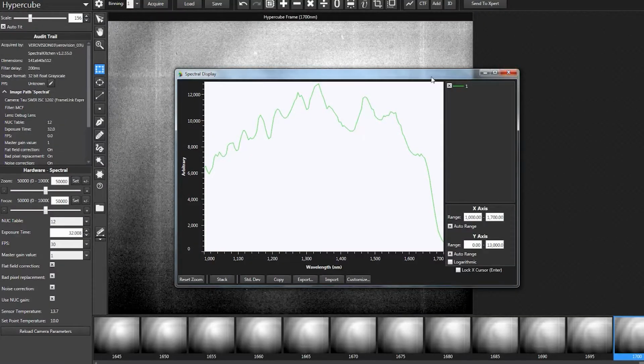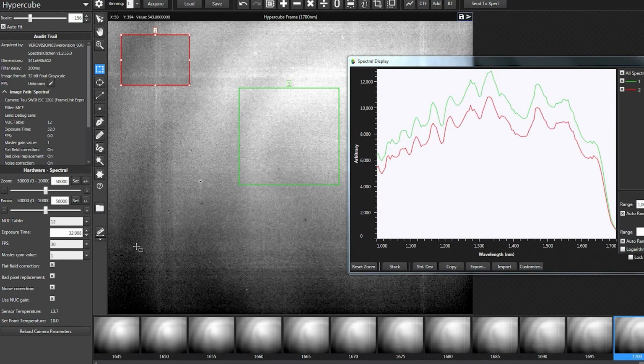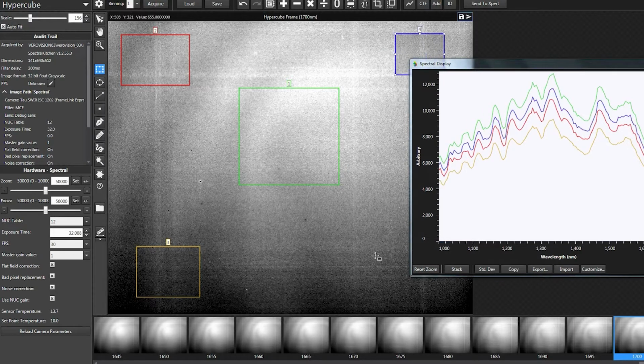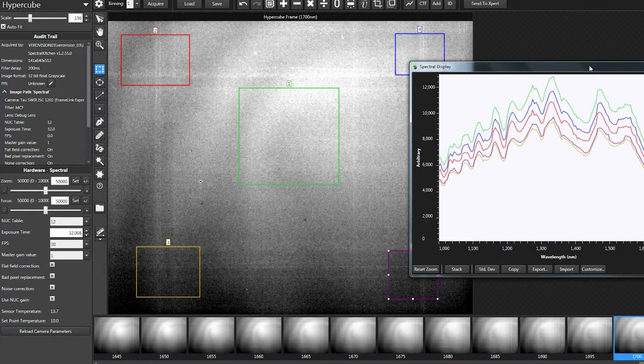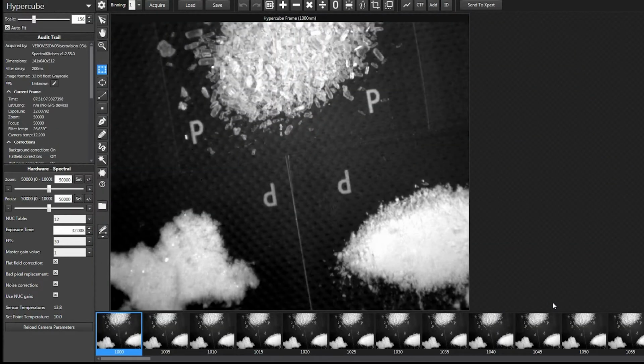Now that we have the raw data on the tablet's active ingredients and the instrument response, we visually review it. This is a necessary step to ensure that you have good data, both sufficient signal levels and a sensor that is operating in its spec range. Because the instrument response dominates the raw data, note that the reflector spectrum and component spectrum appear similar. It's only when we isolate the spectra of the active ingredients that we can observe critical target data.